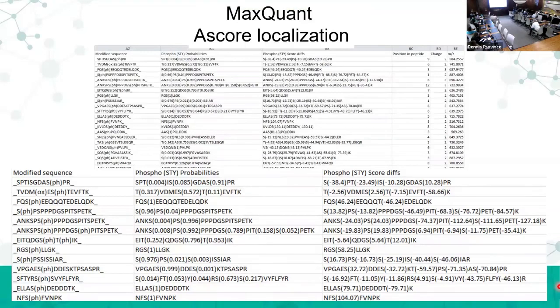And so these are phosphopeptides that we identified. If we take the first one here, the data says that there's a 0.4% chance that this third residue, this threonine, is phosphorylated. So it's probably not that. Well, there's a little greater chance this serine. It's almost 9% chance that it's that. But 91% of the fragments in the data say that it's this serine that's phosphorylated. And so this is probably right, but the one that's 9% may actually be right too, right? It could be that 9% of that phosphopeptide is phosphorylated on that residue. And so it's not on both, it's on one or the other.